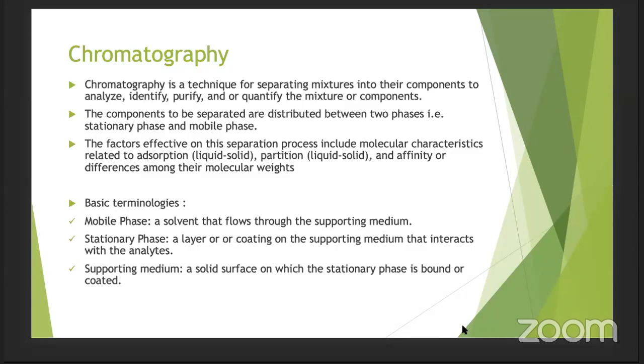So yeah, we were discussing the terminology. The third one is the supporting medium. A solid surface on which the stationary phase is bound or coated is the supporting medium. It could be a column in this case.